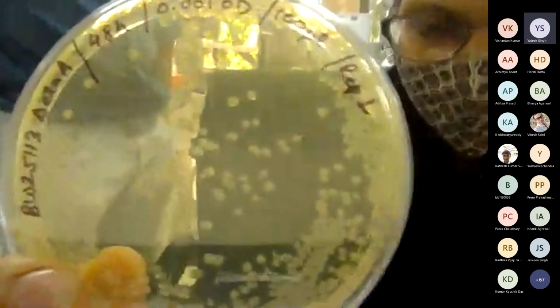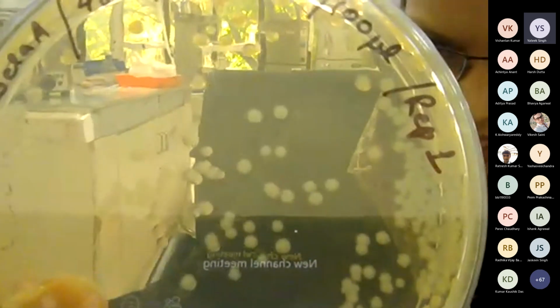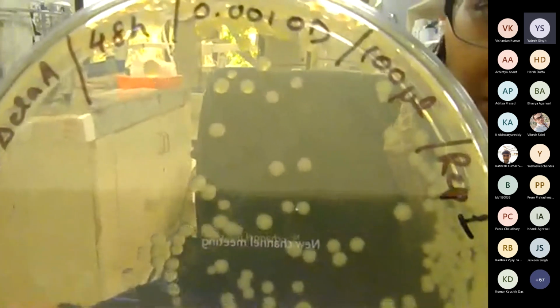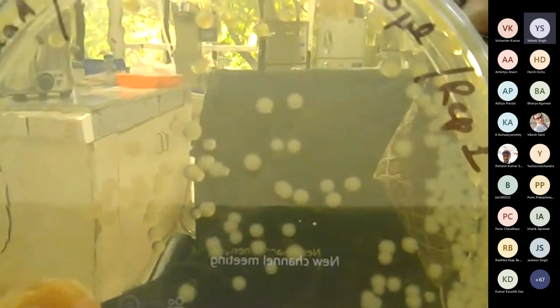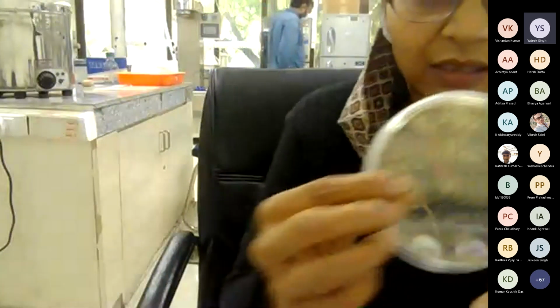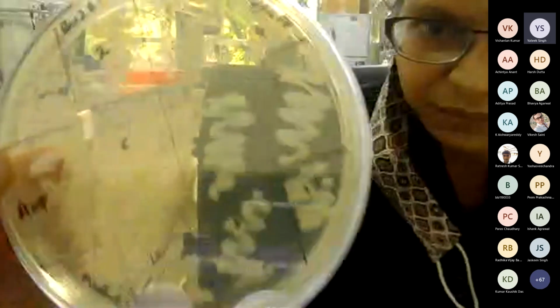Yes, ma'am. Okay. After transformation into the host cell, this is the type of plate we get for our clones. These are the single clones which have our recombinant DNA, the plasmid containing our gene of interest. These single colonies are picked and we make single clones like this.